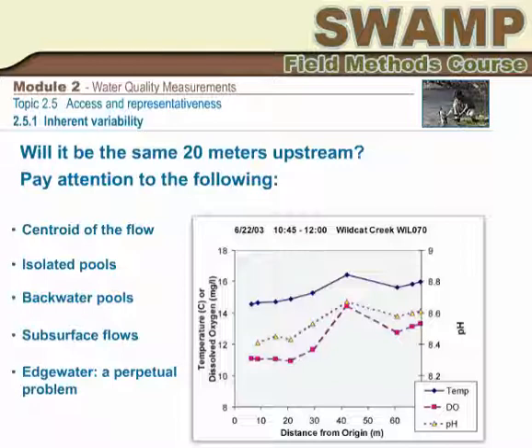In California, during low flow conditions, you can usually wade into the habitat units of interest and away from all edgewater areas to perform the measurements with the probes directly, otherwise known as in situ. Go to the next screen to see access options and examples of things you can do when wading is not possible.